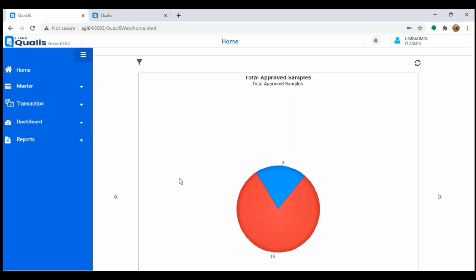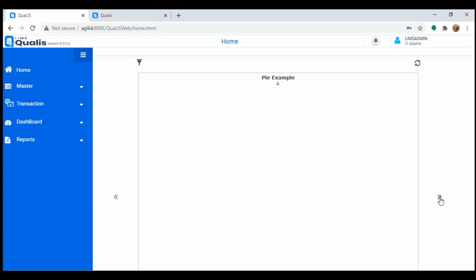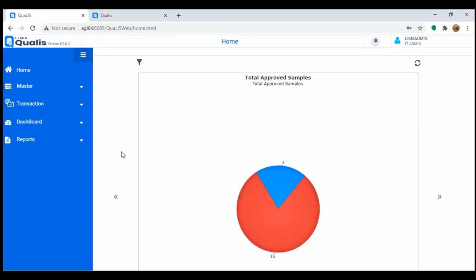Okay. Now once you log in, this thing is a dashboard and you can see it is a multi-page dashboard. So it can go on. This is configurable. That's one of the strengths of our product, that when they log in, there are 2 important things. One is dashboard, which they can configure based on their interest. Second is alerts. Dashboard is a summary. Alert is activity pending for me to do. That is how it is.